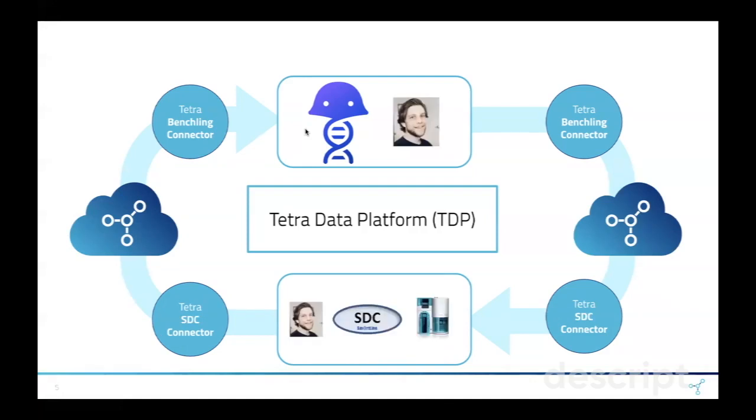And I'm actually going to show you a live demo of this. In this case, I'm going to design an experiment in a Benchling notebook, record some samples that need to be sent to a CDEX high-res instrument being controlled by a SmartLine Data Cockpit instance. And then we're automatically going to get the data back into that same notebook.